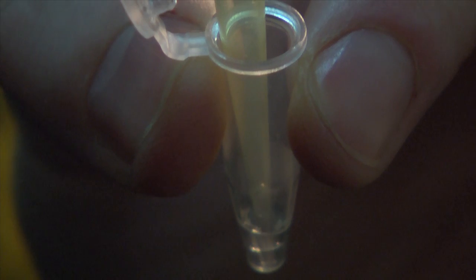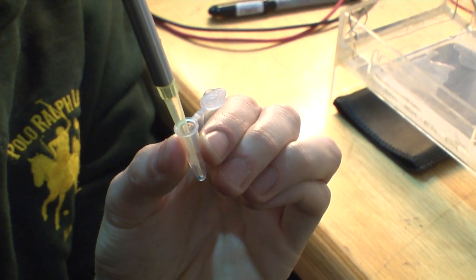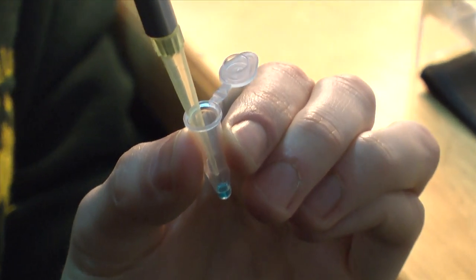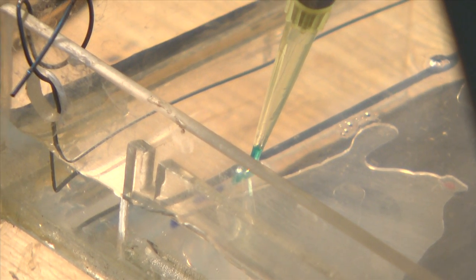So I'm going to add 15 microliters of each sample, and I'm going to add it to 3 microliters of loading buffer, which is in here already, and then take another 15 of that, and put it in the gel.